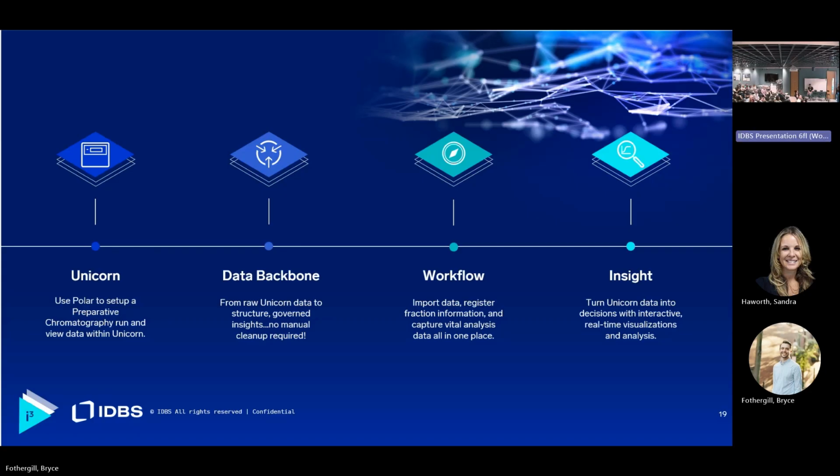that gap, right? So the bit that I spoke about yesterday, which was not in this presentation, is really the framework to enable that seamless bridge of communication between an agent, a gateway which runs on premise, and pull that data directly into the backbone as and when the user triggers that through their workflow. Okay, thank you. No problem.